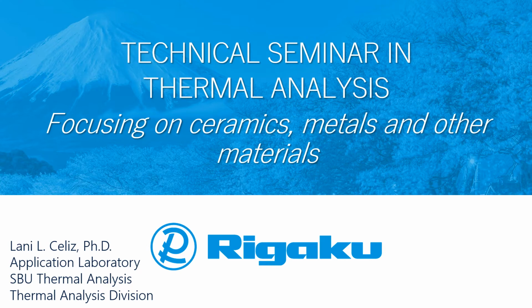Today's topic focuses mainly on metals, ceramics, and other materials using simultaneous thermal analysis or STA, differential scanning calorimetry or DSC, and evolved gas analysis or EGA methods.